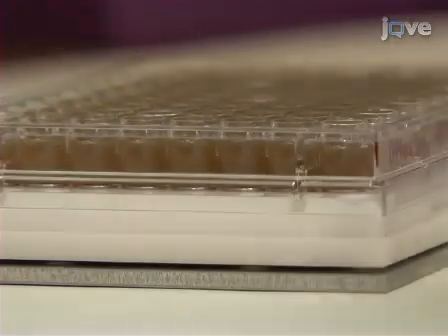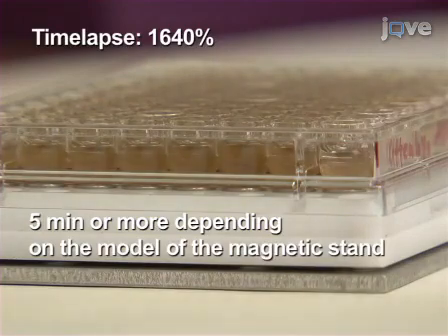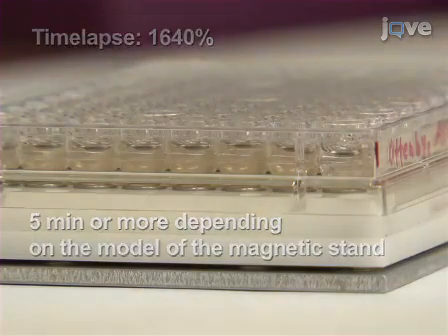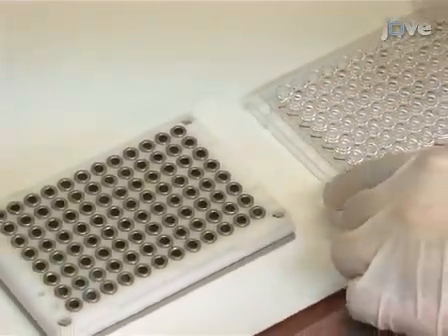Next, move the plate to a magnetic 96 well stand to capture the beads. When the solution has turned completely clear, use a pipetter to remove and discard the supernatant. Then remove the plate from the magnetic stand.